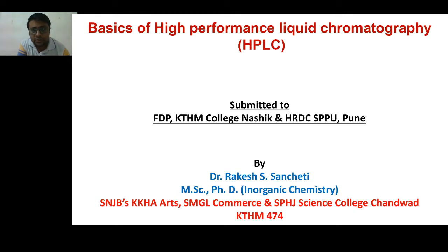Today I am going to discuss the chromatography part. Chromatography is a technique which is widely used in analytical chemistry as well as in pharmaceutical chemistry. This technique was discovered by the scientist Michael Tswett.